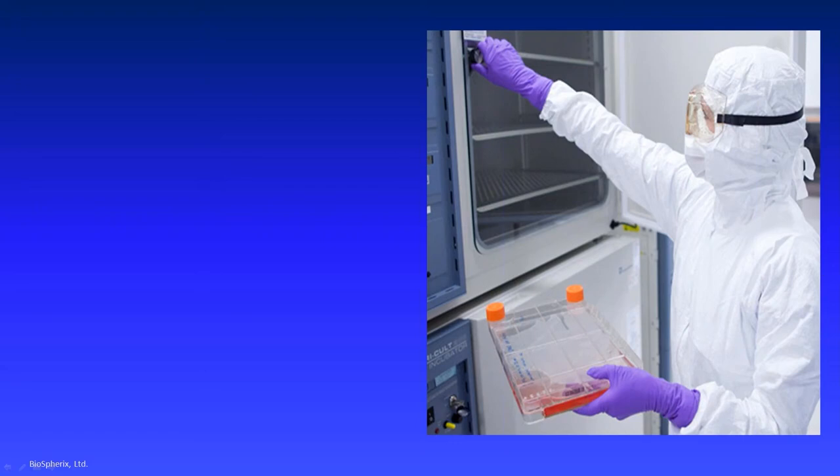And if you think about it, even in the pinnacle of cell culture technology, the cleanest clean room you could find anywhere in the world, you have the same source of variability as you find in the rudest, crudest, most basic lab anywhere. In fact, in clean rooms, it's even worse, because in clean rooms, people have to wear layers and layers of clothing. So they keep those rooms cold, which makes it worse for the cells when they're exposed to that room air environment.